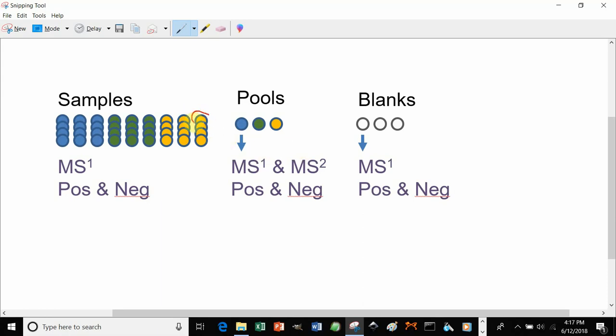If you do not have pools, you can run tandem mass spectrometry, or MSMS, on one representative sample, or two or three, from each of your sample groupings. These will be used for identification purposes.